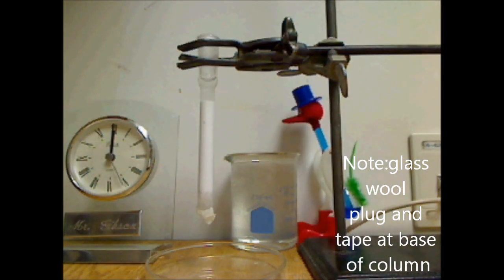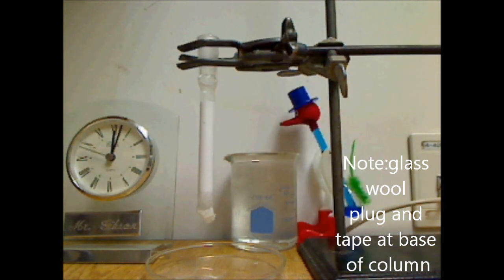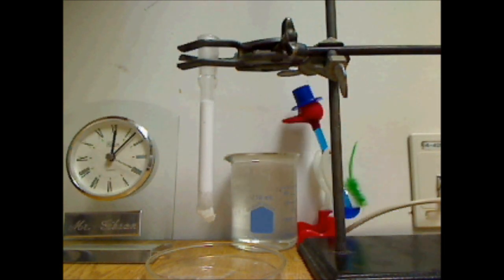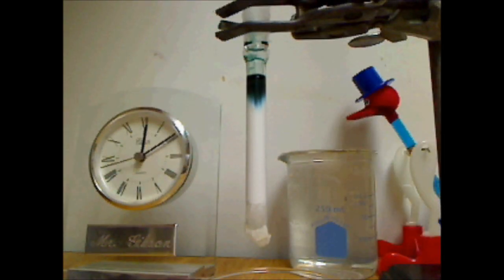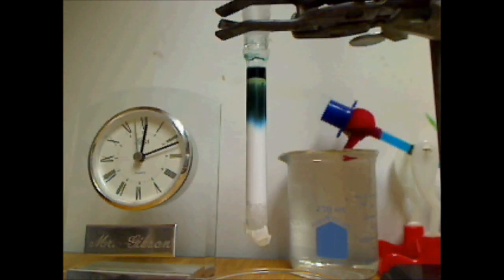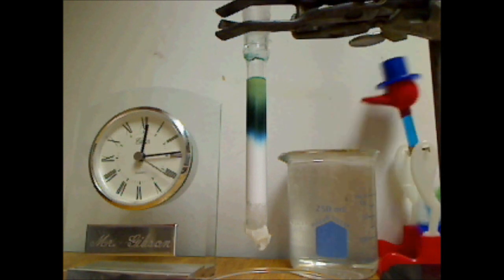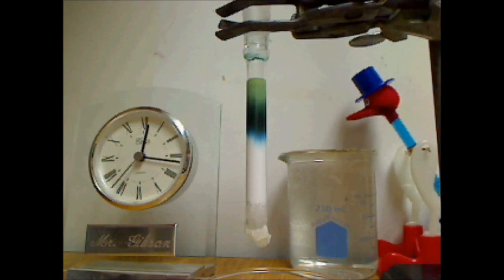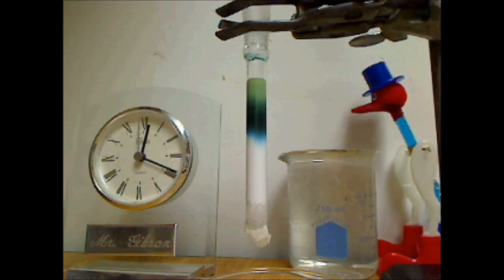Here's my column full of alumina, and I'm running the water mobile phase through first of all. Once that's gone, I've put in my sample of black ink from a black pen. Now you can see the black ink is being split into two here.